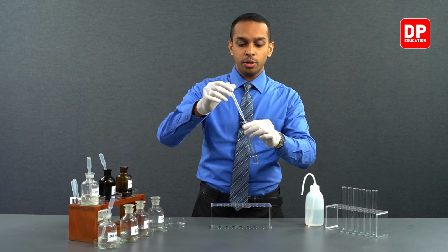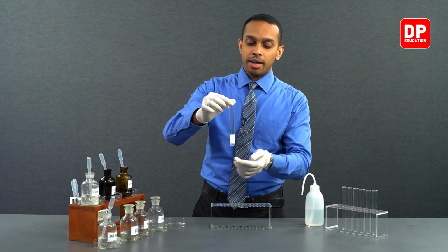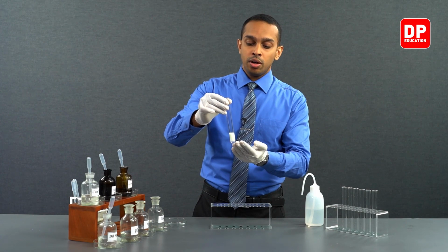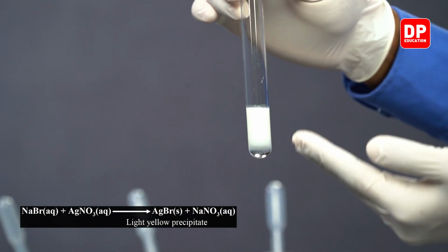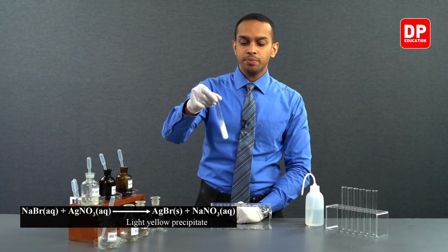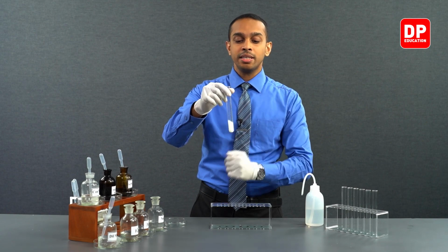Silver nitrate solution will introduce silver ions into the medium. As you can see, as soon as I put a little bit of silver nitrate into the test tube, it will react with the bromide ions in the solution and will form a pale yellow precipitate. Now this is silver bromide. We'll mix it together quite well. You can see the precipitate that is formed over here is a pale yellow color.